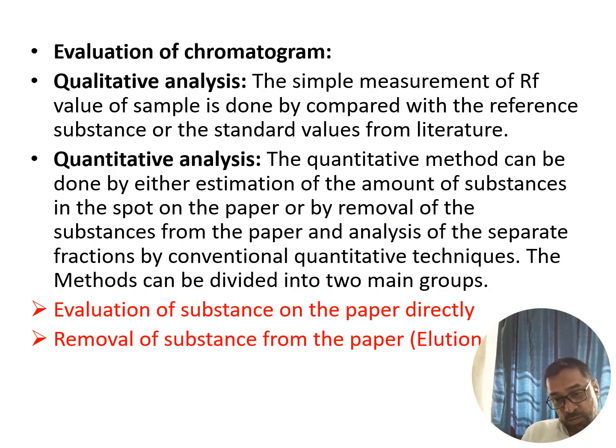After the detection technique, we need to carry out evaluation of the chromatogram by means of qualitative or quantitative analysis. In qualitative analysis, we compare the Rf value which we have obtained practically with the reference Rf values. In quantitative analysis, we measure the area of the separated components, how much area was recorded after application of the sample, and through this we can find out the quantity of each individual component separated from the mixture.